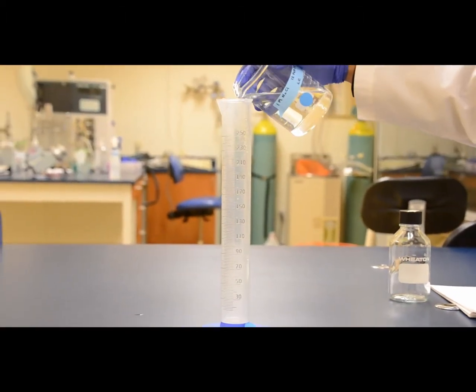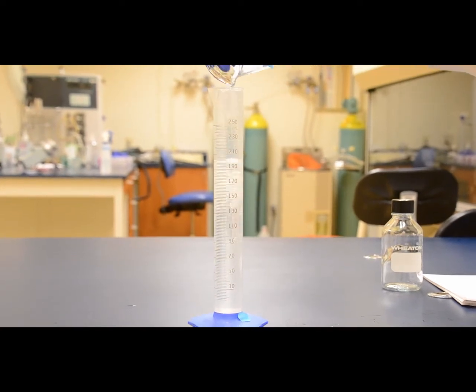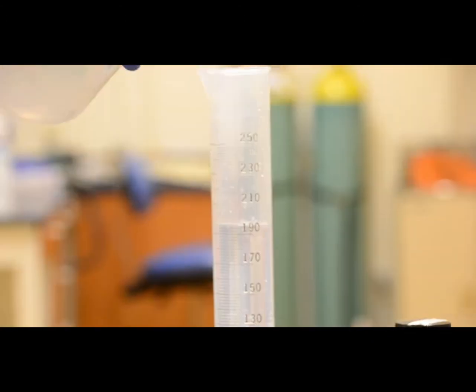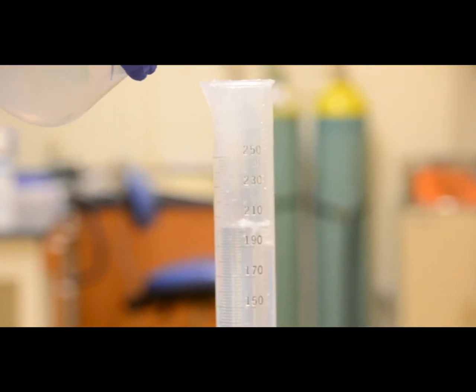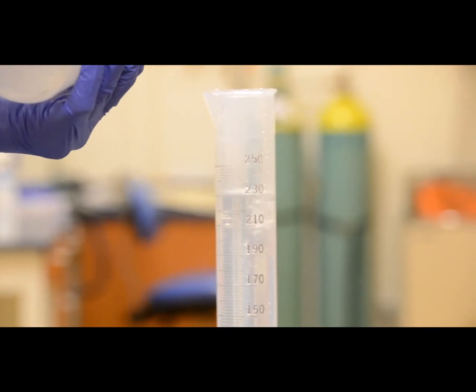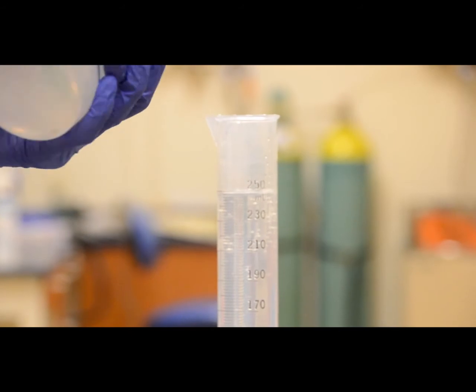Pour the solution from the beaker into the graduated cylinder from earlier. Now is a good time to transfer your label from the beaker to a bottle. Now we add more deionized water to bring the solution up to the final desired volume, in this case 250 milliliters. Stop when the bottom of the meniscus is at the correct measurement.